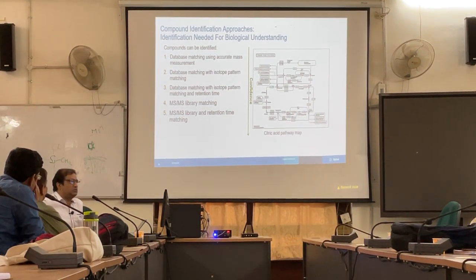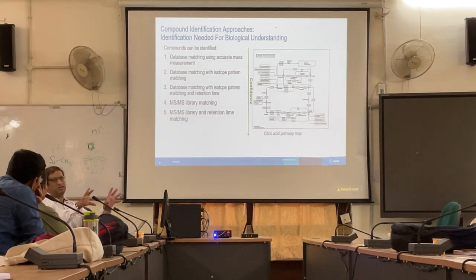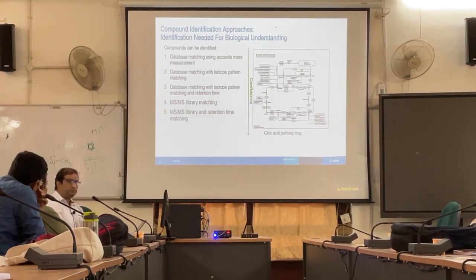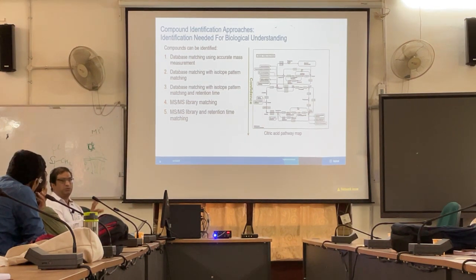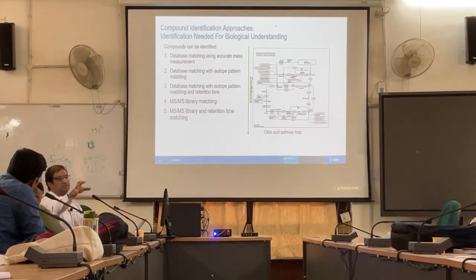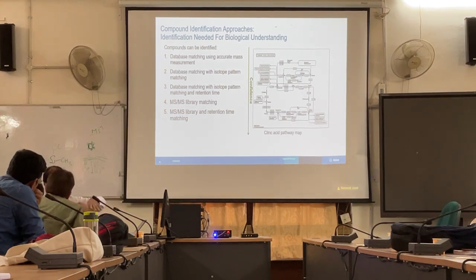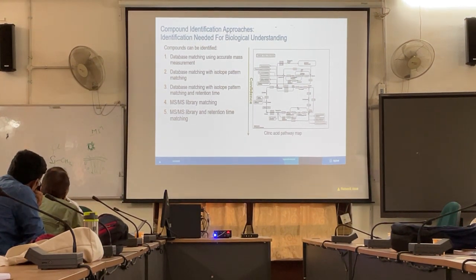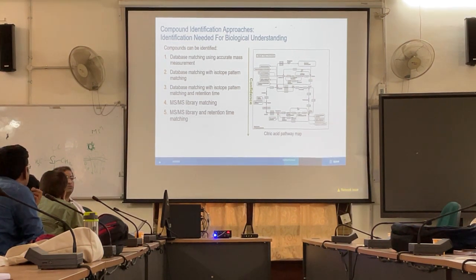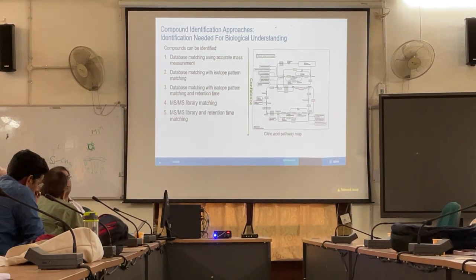What are those bioinformatics tools? As sir was mentioning yesterday, there is chemistry and fragmentation. All those things are chemistry based. Now, biology based. What is biology based? There are only a certain number of metabolite pathways which are possible, right? So if you have a lipid, it will undergo beta oxidation or some such. Only a certain number of reactions are possible on a lipid. And the main compound will remain and something will be added or something will be lost at one step or the other. You will miss that modified metabolite because you are not sure of extracting it there.